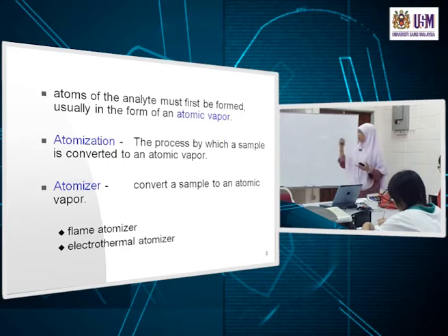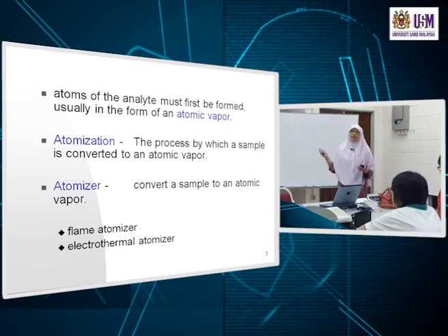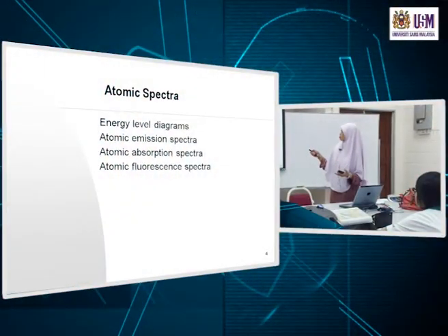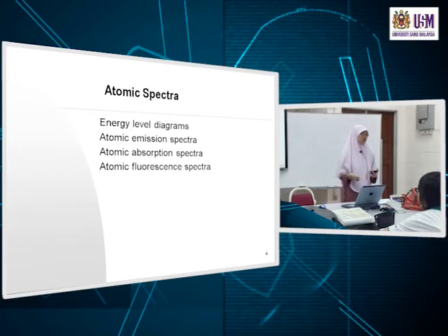Or we have another one that we will be looking at, which doesn't use a flame, but uses electrical energy to atomize the sample. As I've said, some of these things will be a repetition, but it's an important introduction to when we get into atomic absorption.